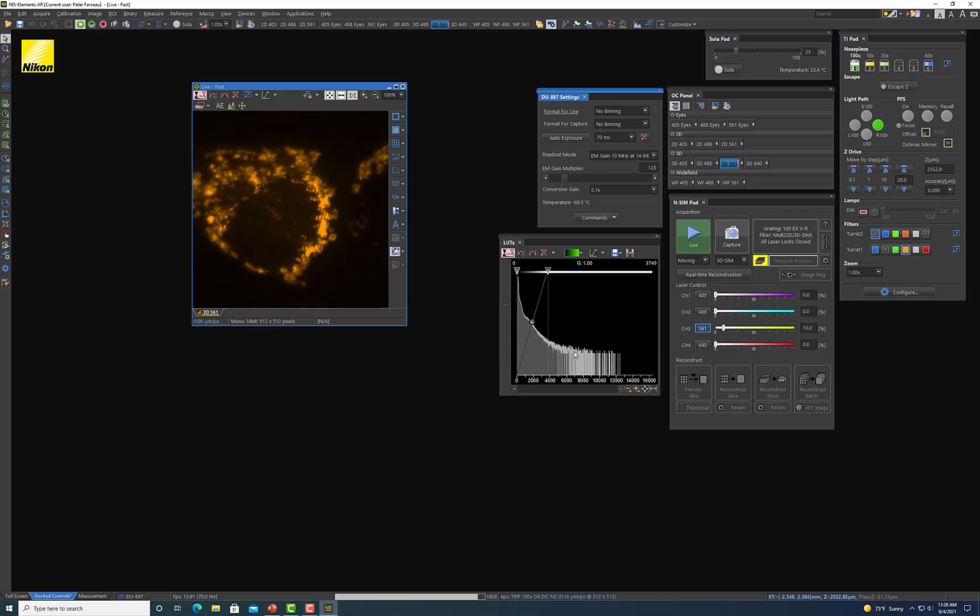Again, all I'm really looking at here is my lookup table. I can see the patterning, so I know it's in focus there. So I'm going to hit stop now. I'm going to update my preset again. And now what I've done is I've updated all three of the presets, optical configurations that I'm going to use to ultimately acquire a 3-channel SIM image.